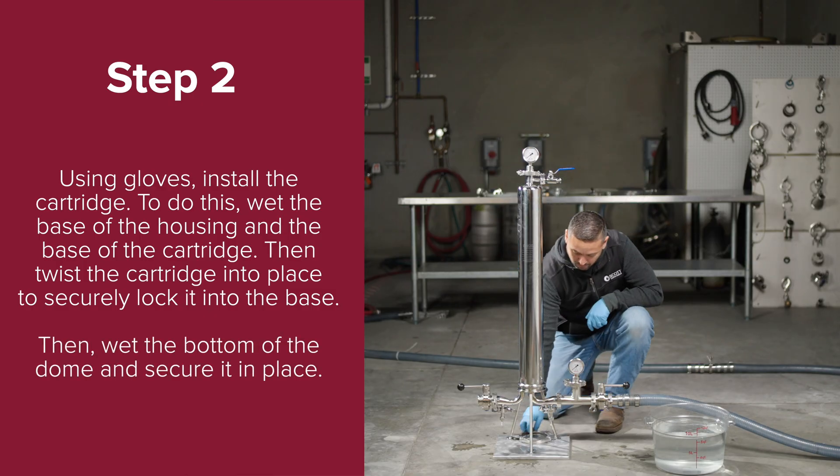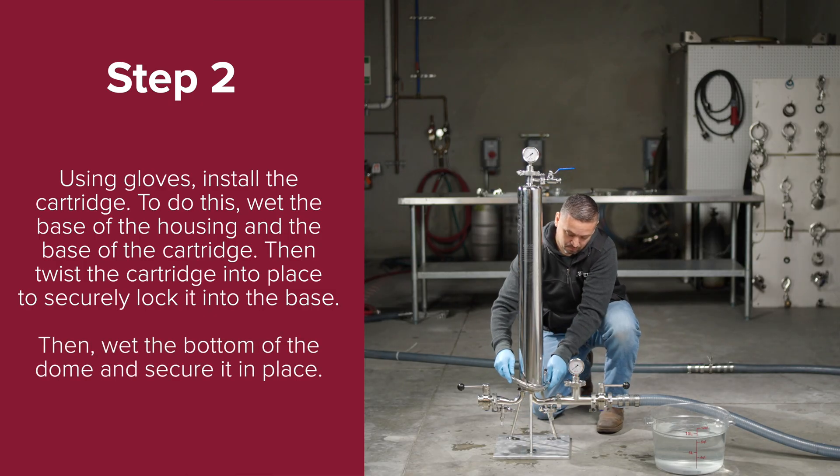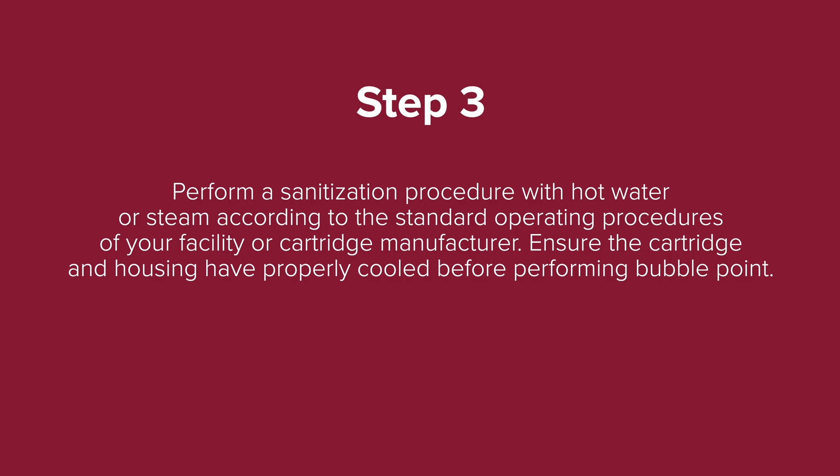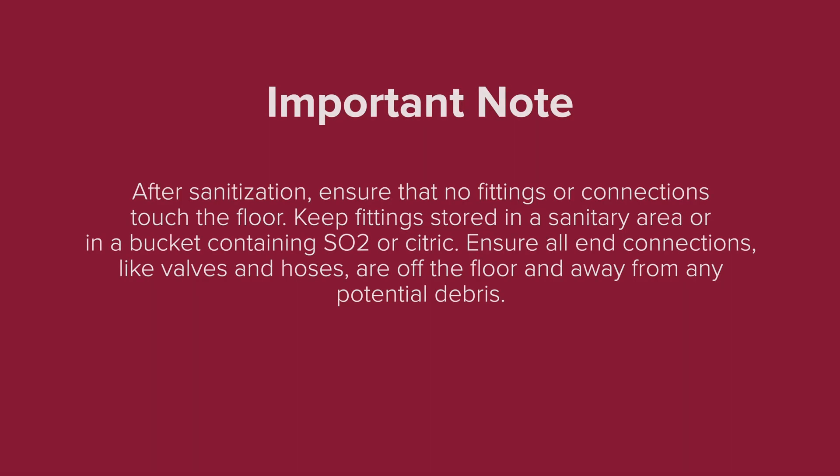Then wet the bottom of the dome and secure it in place. Step three: perform a sanitization procedure with hot water or steam according to the standard operating procedures of your facility or cartridge manufacturer. Ensure the cartridge and housing have properly cooled before performing the bubble point test. After sanitization, ensure that no fittings or connections touch the floor. Keep fittings stored in a sanitary area or in a bucket containing SO2 or citric.